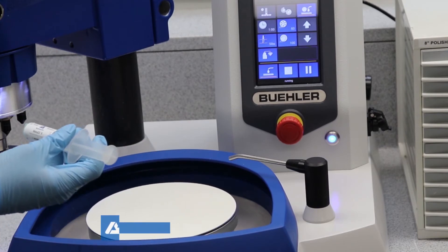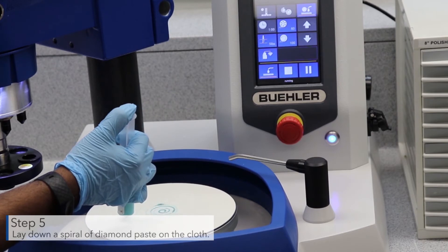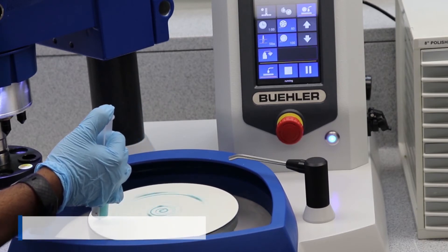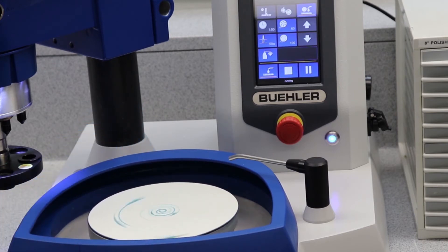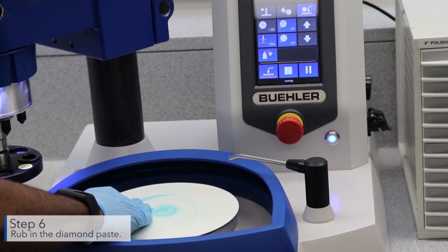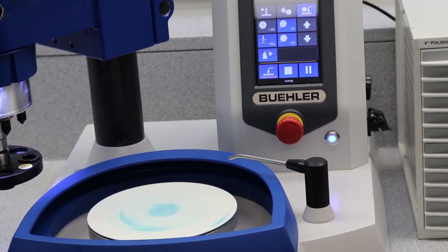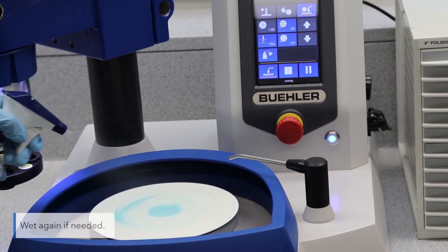Lay down a spiral of diamond paste on the cloth. Rub in the diamond paste. Wet the cloth again if needed.